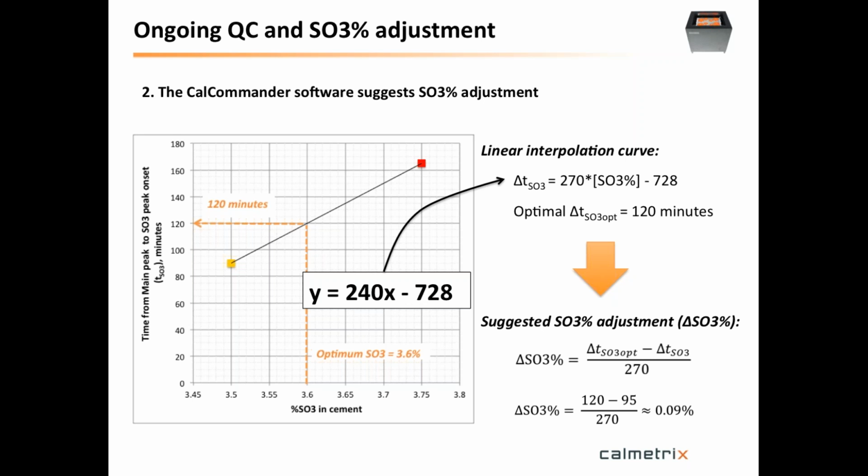And besides telling you something about optimal sulfate and whether you have a certain consistency in your manufacturing, it's a way to have a continuous curve of how things happen. You continuously see how the kinetics of your reaction unfolds. So you have something that you can use to trace it back to certain problems. If something does not look right, you can analyze it and see what's happening on the rest of the curve. So it's a very, very powerful tool.